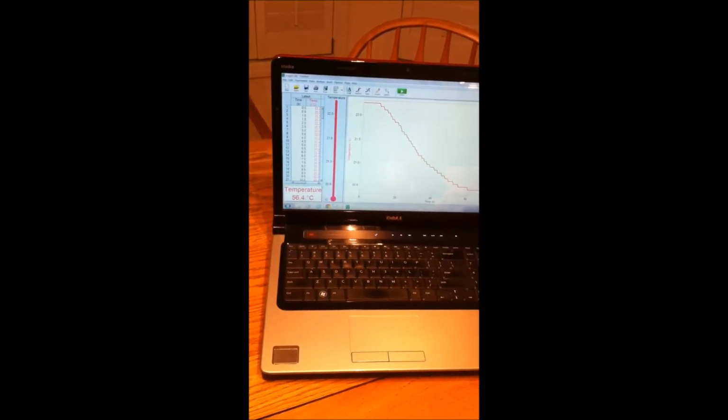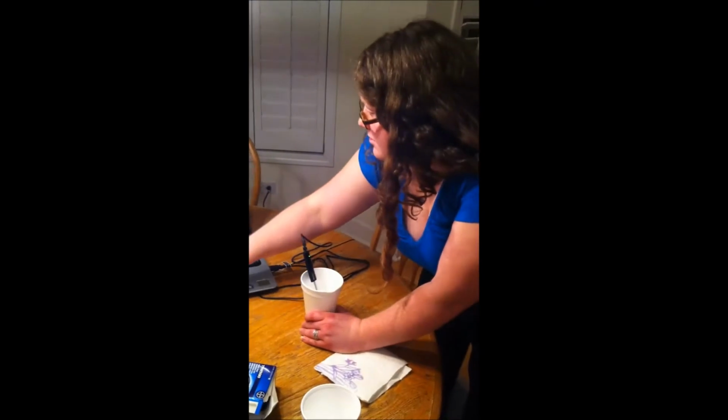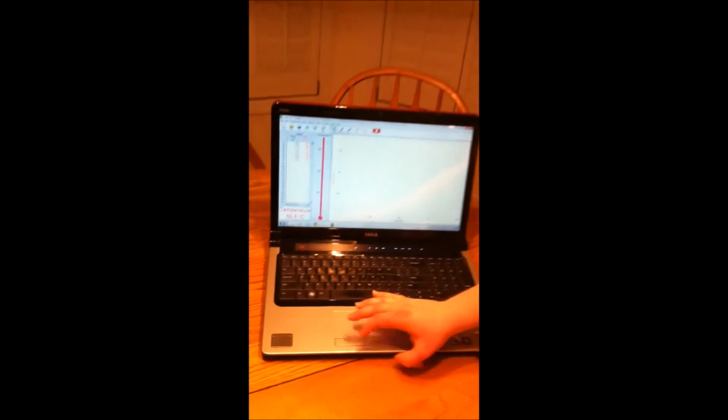And so it looks like our temperature has leveled off. And what's the temperature reading, Debbie? 56.3 centigrade. All right, great. So I'm going to drop in the tablet after I start collecting data. All right, do you think it's an endothermic or exothermic reaction now? Dave? Endothermic. All right, so it hasn't changed even though the temperature's changed? No, temperature is still dropping, so it's still consuming energy.